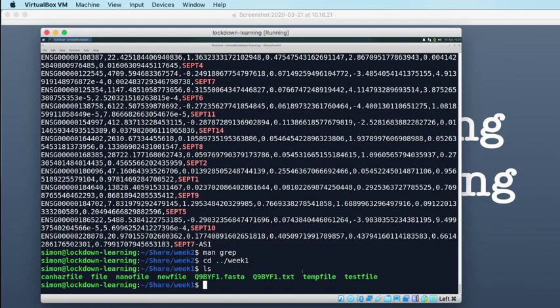So I'm going to do this without really knowing what that line of the file looks like. I don't know if it's talking about taxonomy with the full line, or if it's using an abbreviation. So the first thing that we're going to do is just grep, and I'm going to do it in a case insensitive way.